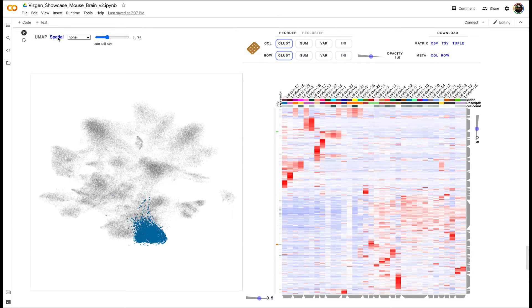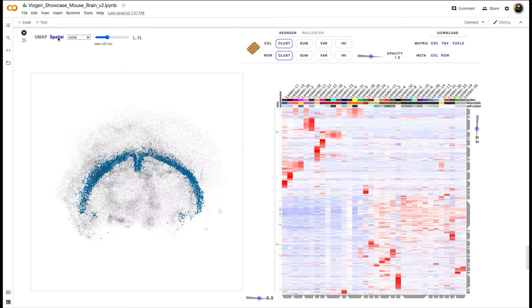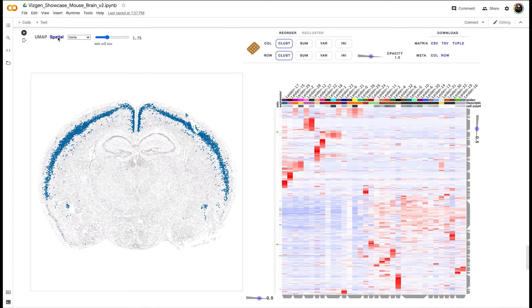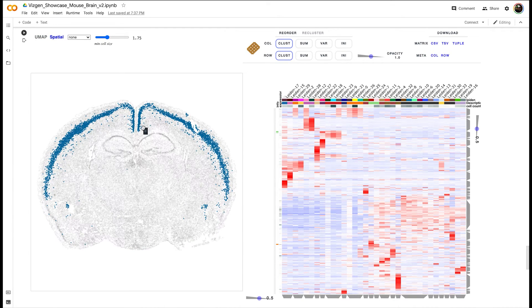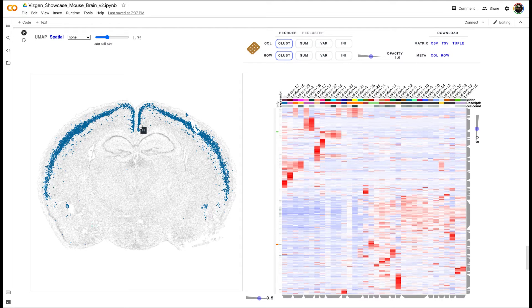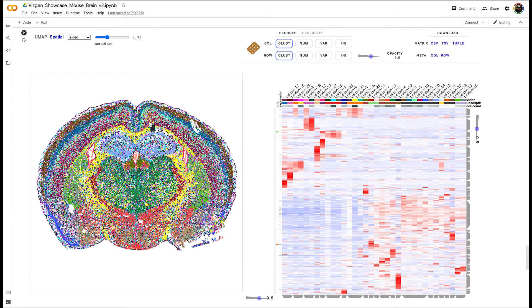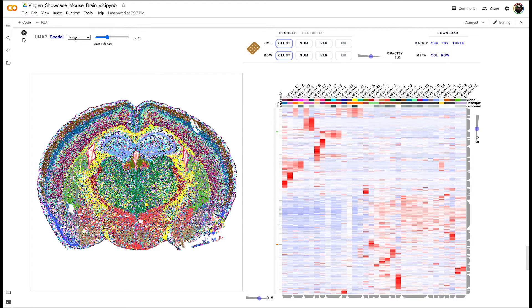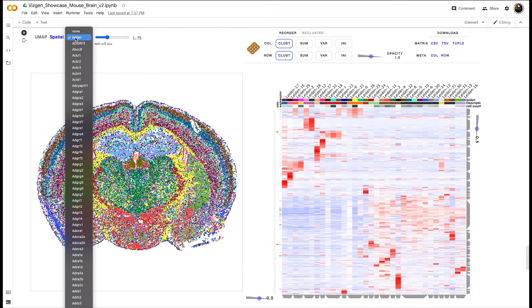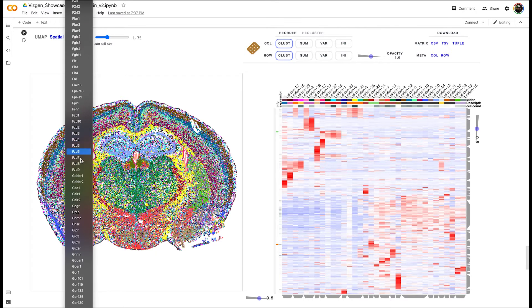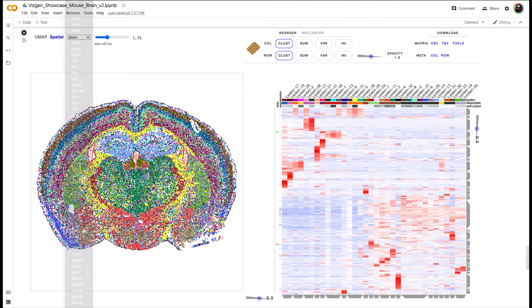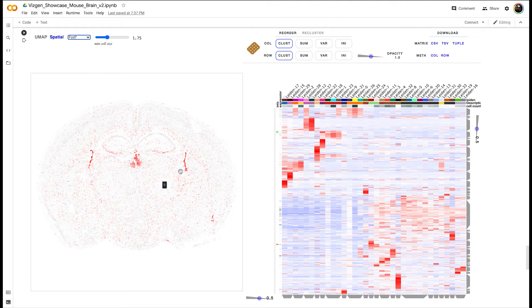This information, of course, you can only obtain based on spatial single-cell transcriptomics techniques. Aside from selecting clusters, you can also use this drop-down menu to click any gene that you're interested in and to see where that gene is expressed across the tissue.